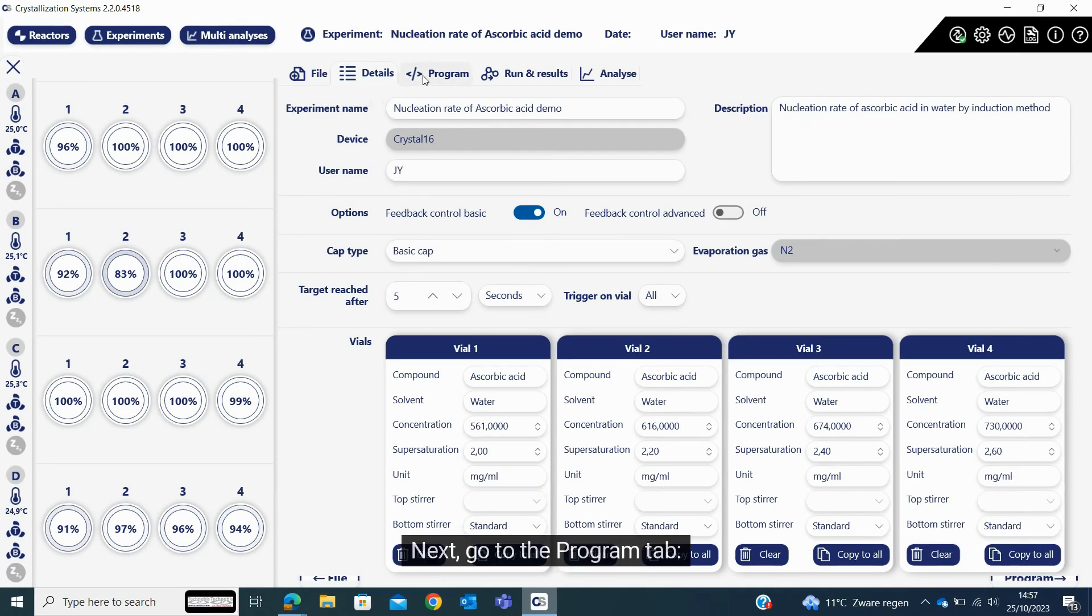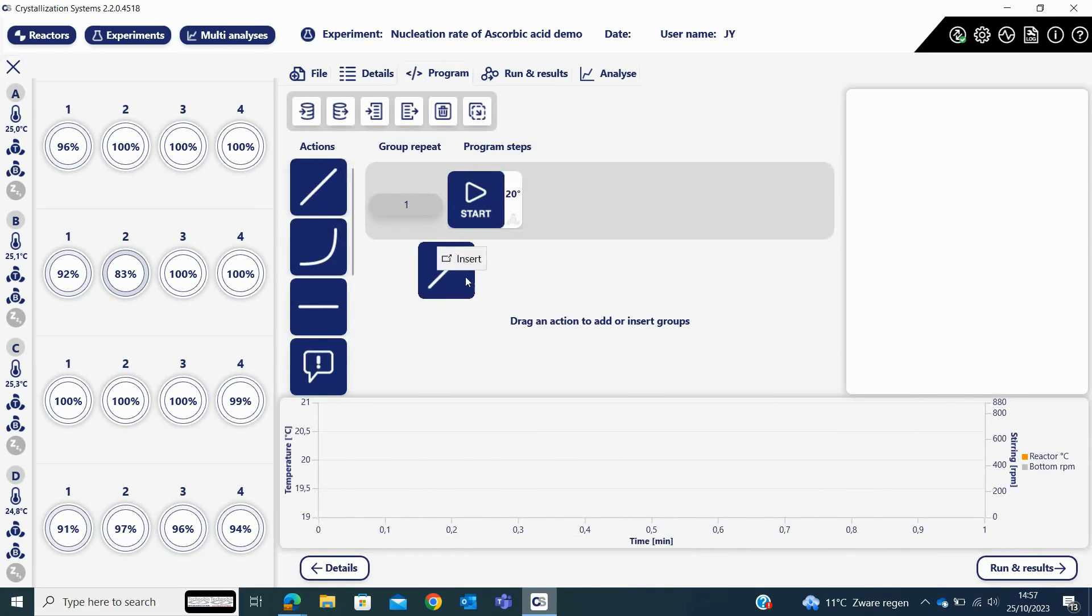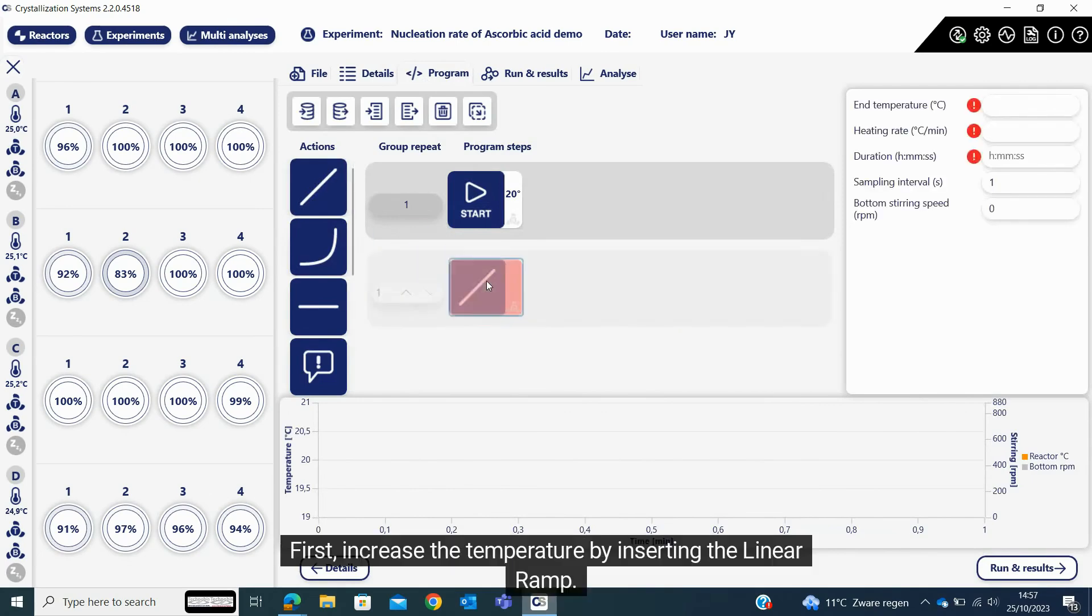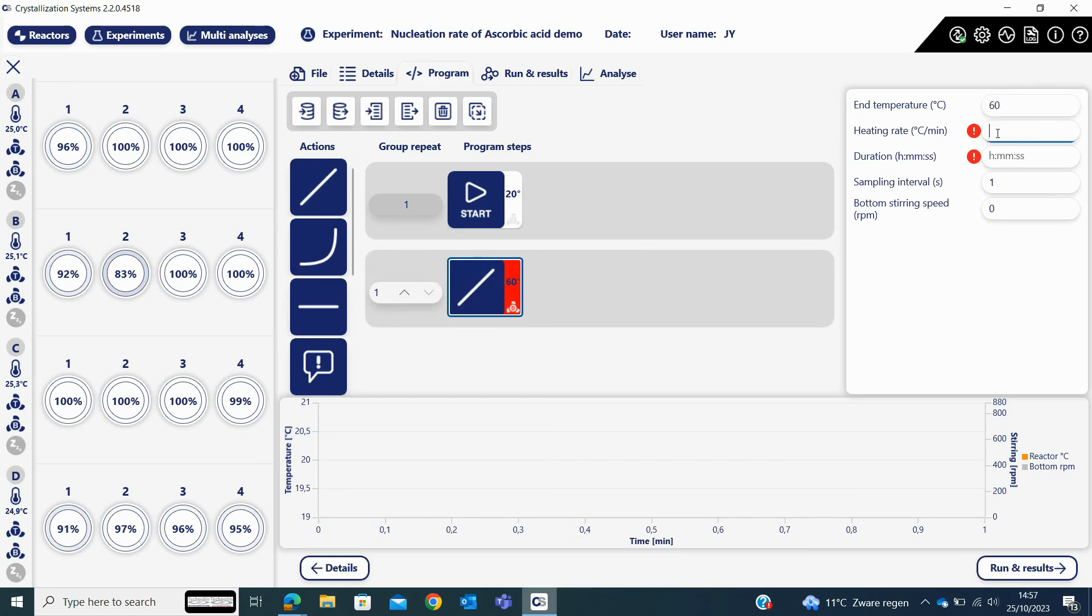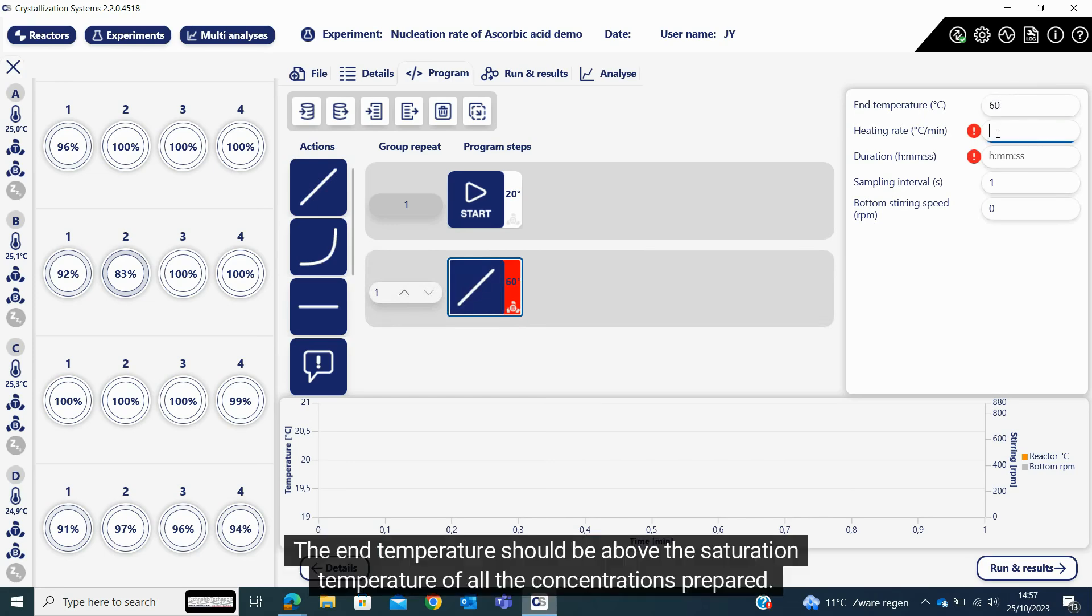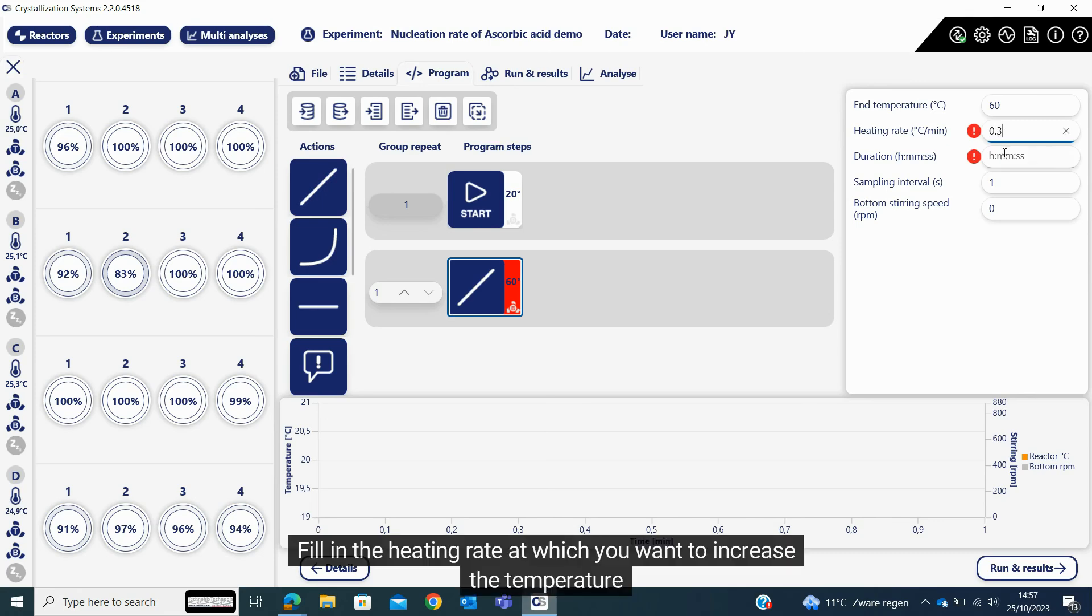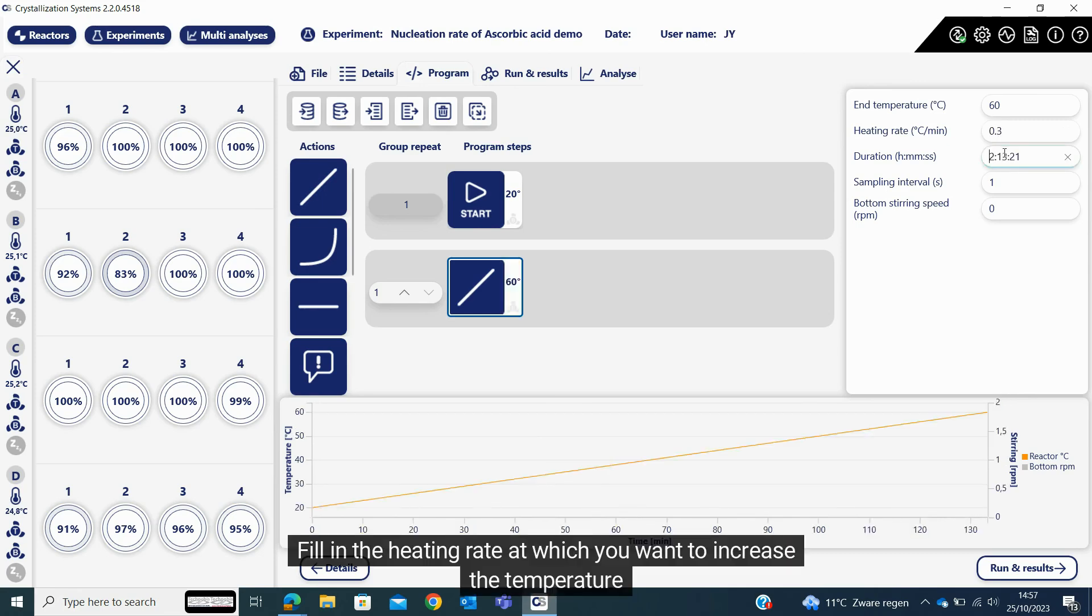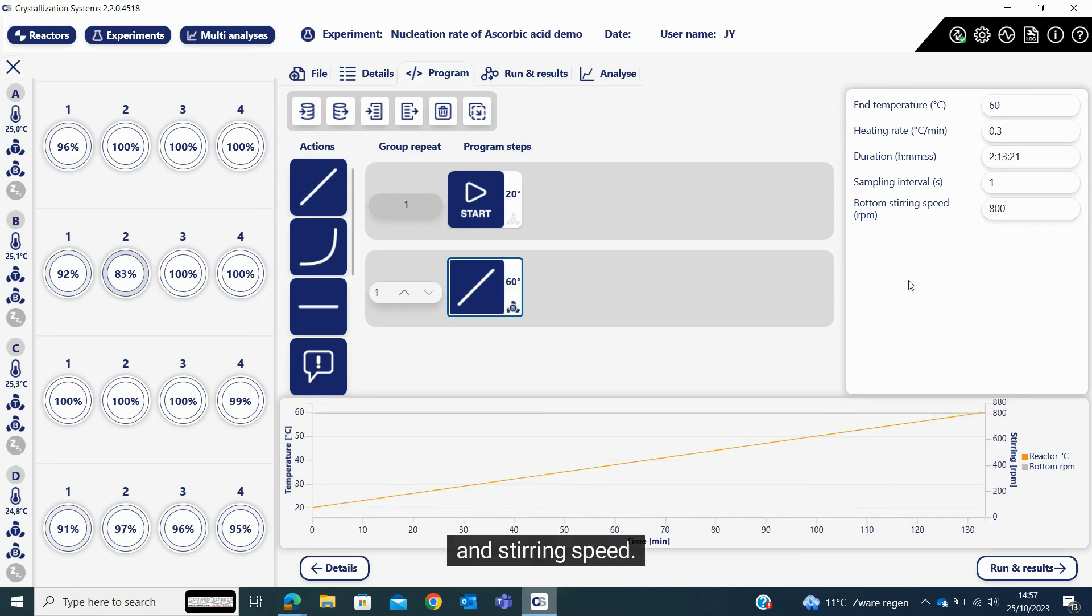Next, go to the program tab. First, increase the temperature by inserting the linear ramp. Fill in the end temperature. The end temperature should be above the saturation temperature of all the concentrations prepared. Fill in the heating rate at which you want to increase the temperature and stirring speed.